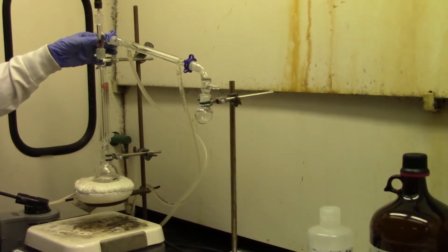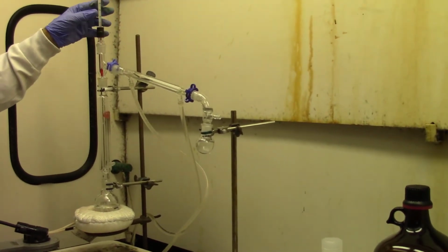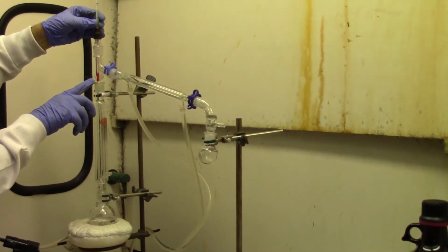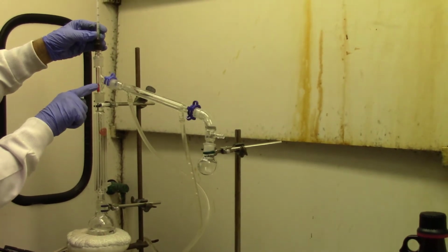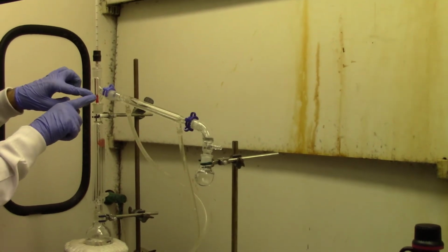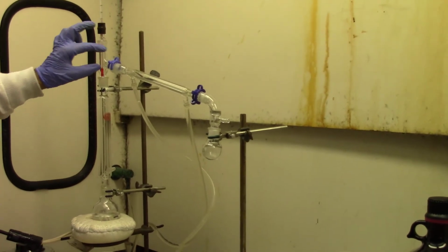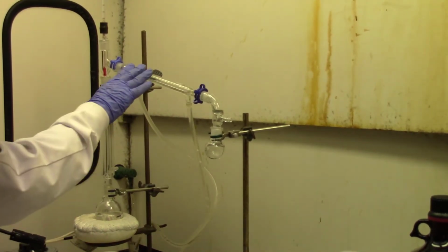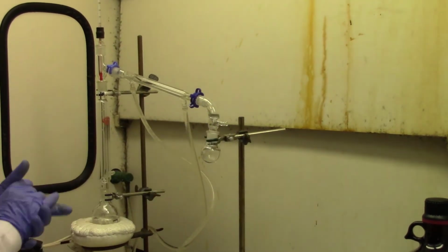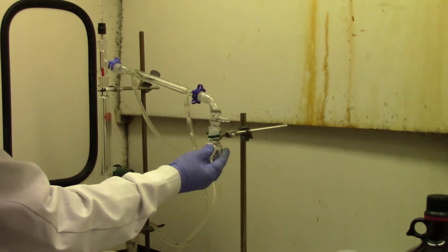This is the three-way connector, thermometer adapter, and thermometer. I'm just adjusting the bulb of the thermometer a little bit lower than the connection of the three-way connector. Okay, so we are ready now. This is the vacuum adapter, fitted with a 25 mL collecting flask. So we have the entire apparatus set up.